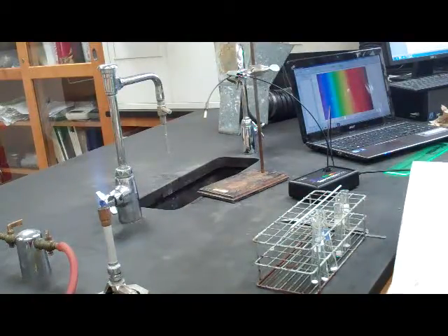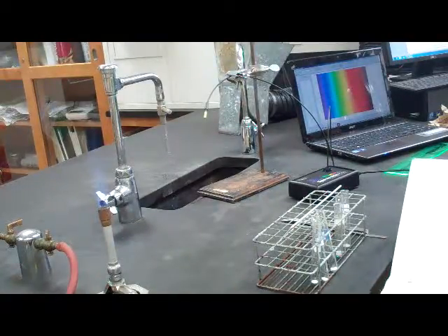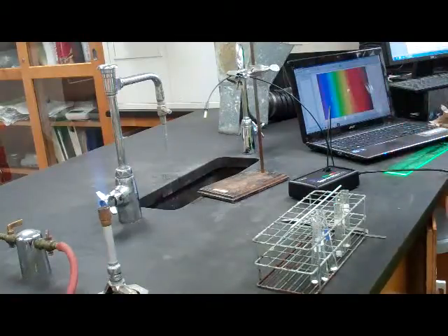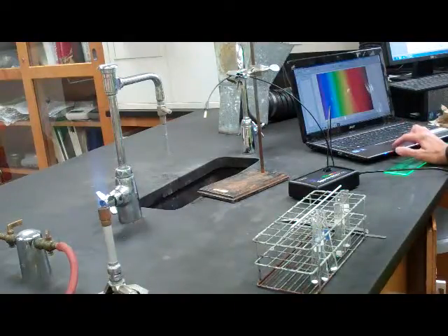Okay, we're going to press the Collect button, and in your notebook describe the flame color and comment on the spectrum. Where is it? How wide is that spectrum? Is it the entire spectrum? If you take a peek, we have an entire spectrum behind us. Is it that entire spectrum or just part?